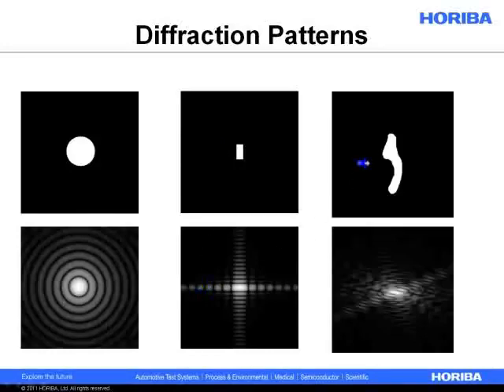But if you have a more realistic-looking particle, something that is very hard to describe using shape terminology, then you'll get a sort of mismatched diffraction pattern. And this is much more the realistic case. So more often than not, this is what the laser diffraction analyzer is measuring, and it has to back out some shape measure from this.